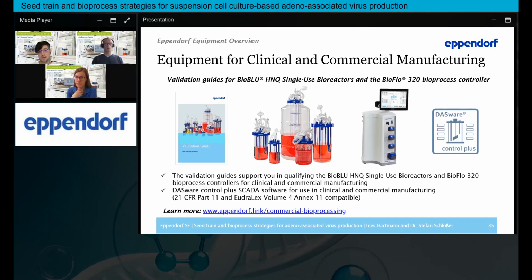For cells like HEK293 cells that need an attachment surface, this would be an option. And by the way, using these also makes scale up easier, because you can just add more of these microcarriers to your culture, and the cells will have new surfaces to attach to. You don't need to change the whole bioreactor for your next scale up step. So this is one option.